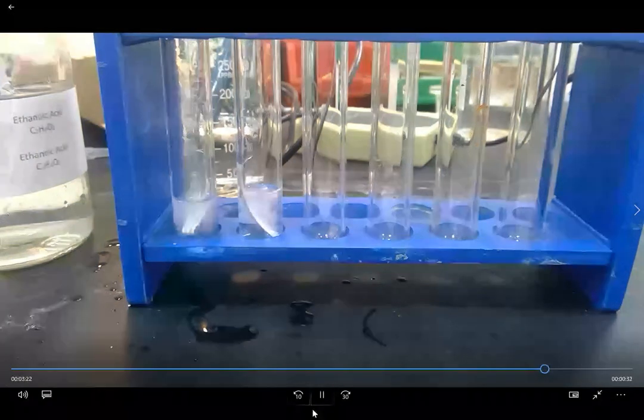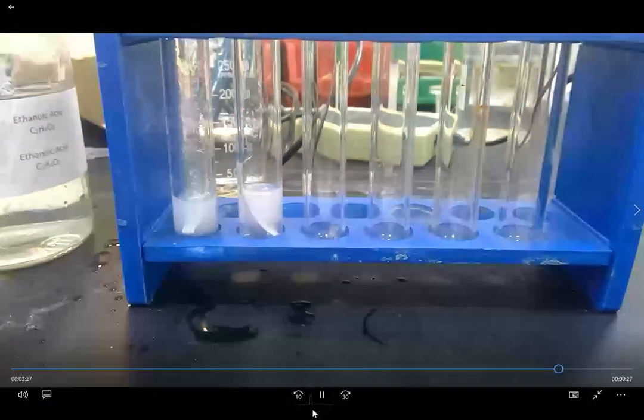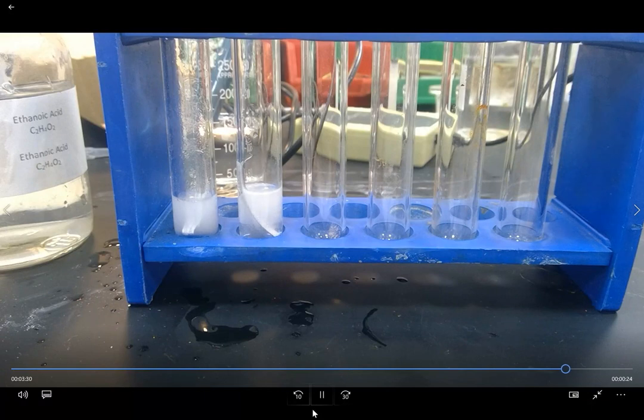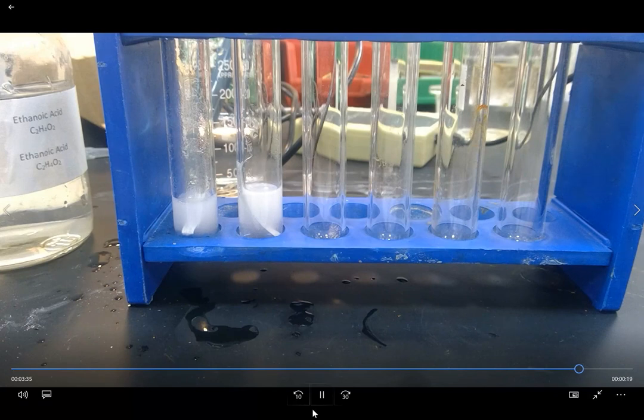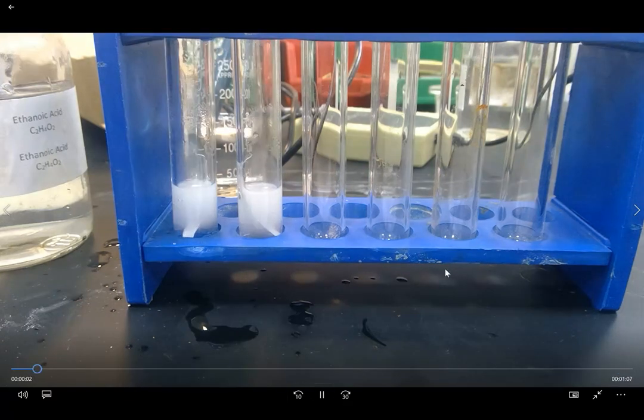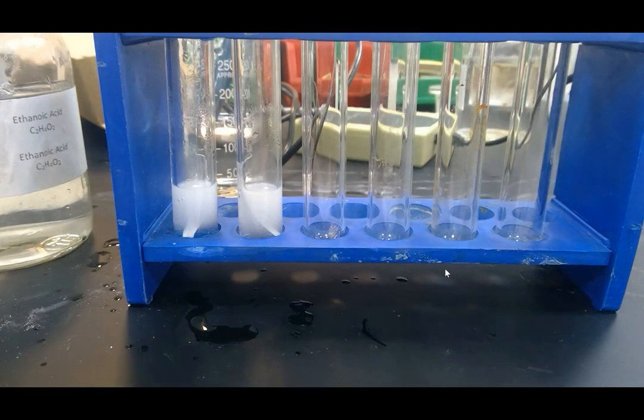Okay, so again, we can see that they are both fizzing, they're both effervescing. And we can see that the number of bubbles produced in both cases is quite high. We're going to wait and see if we can see a difference in those two reactions and how quick they are. While I'm waiting for my magnesium to react, I'm going to set up my second experiment.